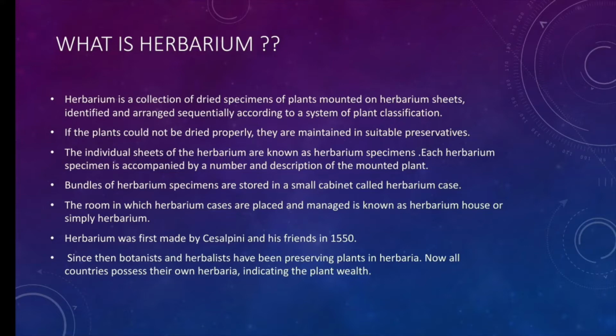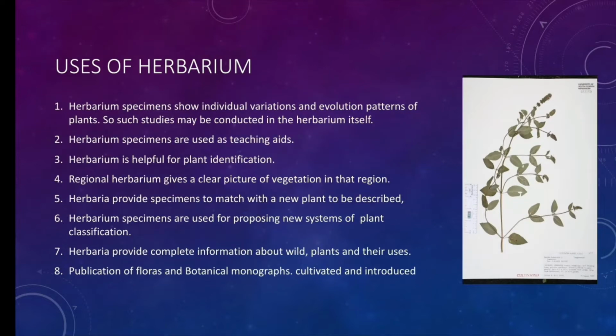If the plants could not be dried properly, they are maintained in suitable preservatives. Bundles of herbarium specimens are stored in a small cabinet called a herbarium case. Herbarium was first made by Cisalpini and his friends in 1550. The next one is uses of herbarium.